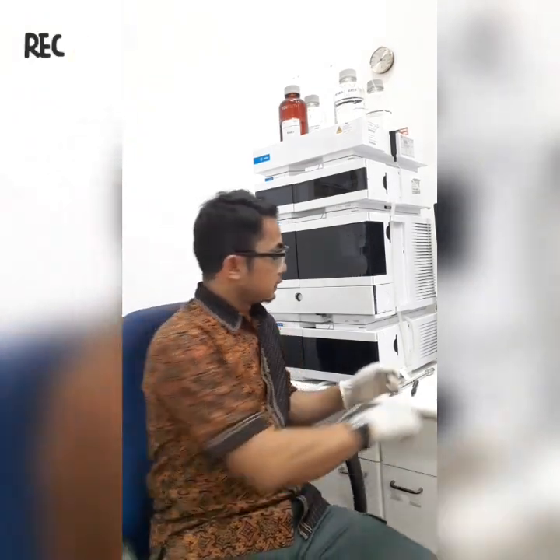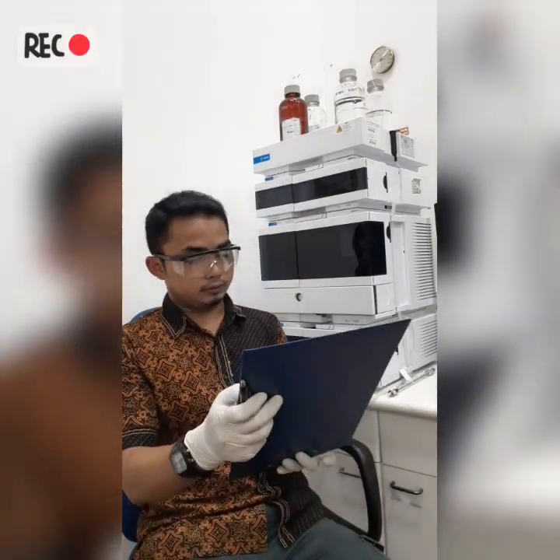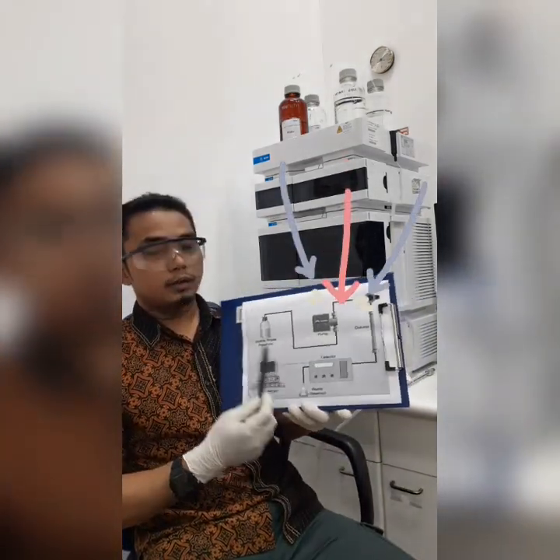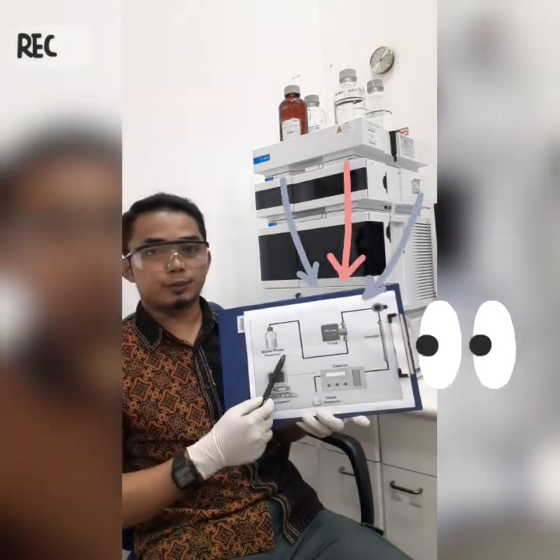Next, how does the HPLC work? I want to give you a chart of how HPLC works. In this figure, you can see the instrumentation of HPLC.